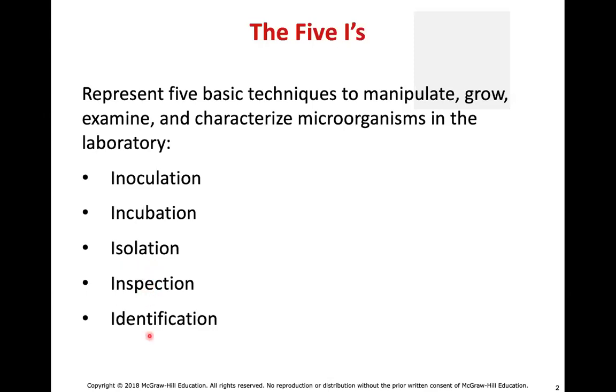Inspection and identification, these are also very important for clinical labs. Realistically, a lot of clinicians want to know what it is, because determining what it is will determine the mechanism in which you're going to go about treating, say, an infection.